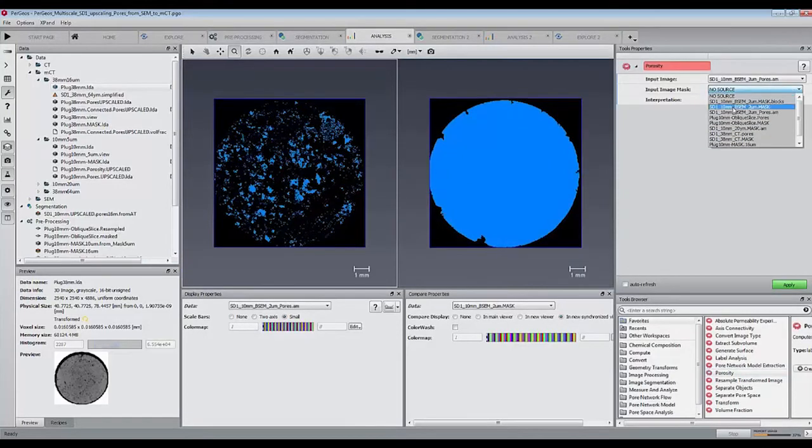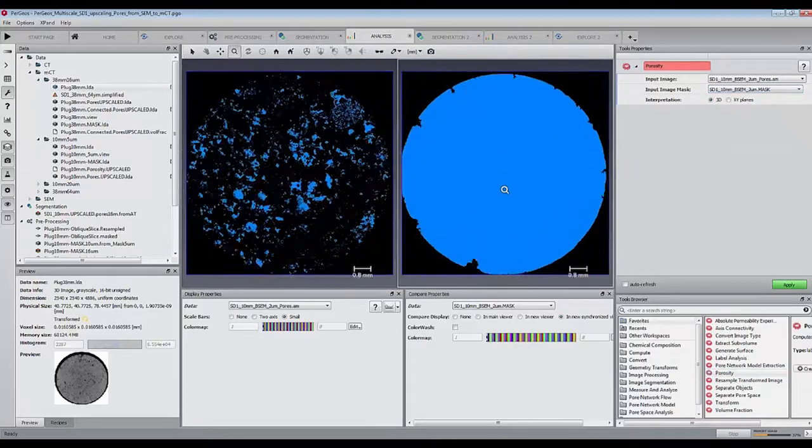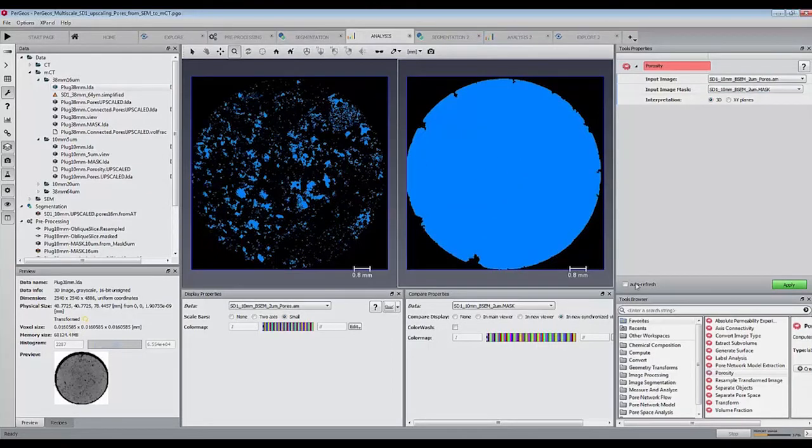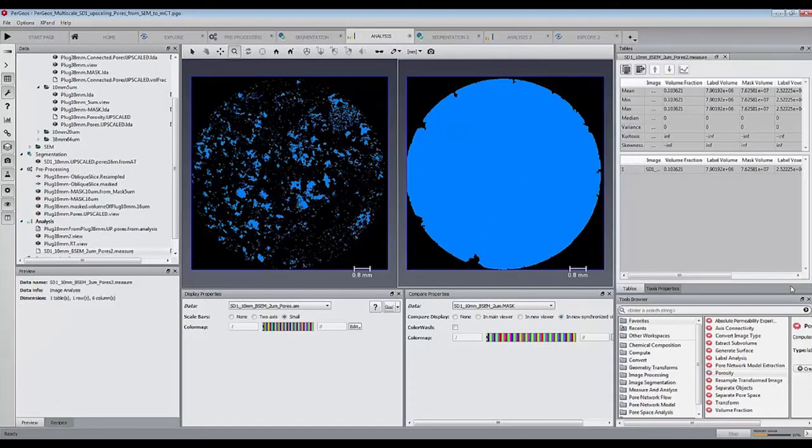Running the porosity module with the pore space and the mask, we obtain a value of 10.36% for the SEM slice.